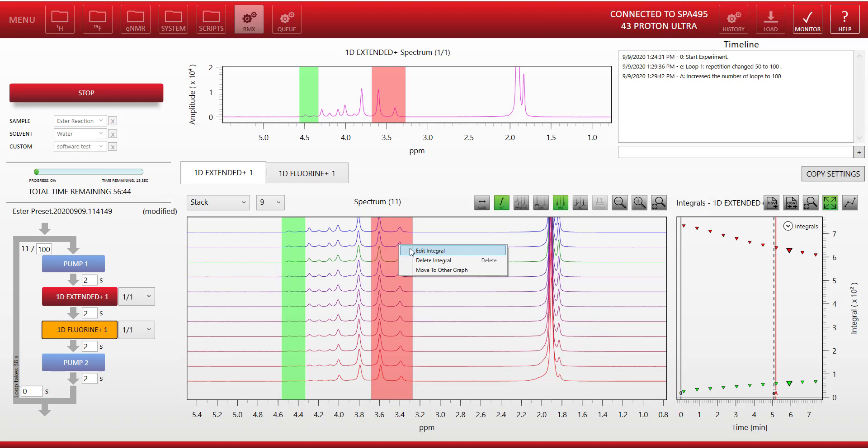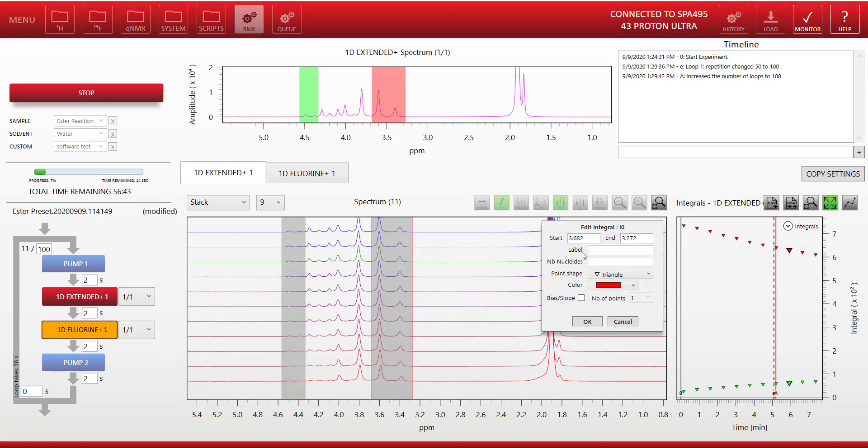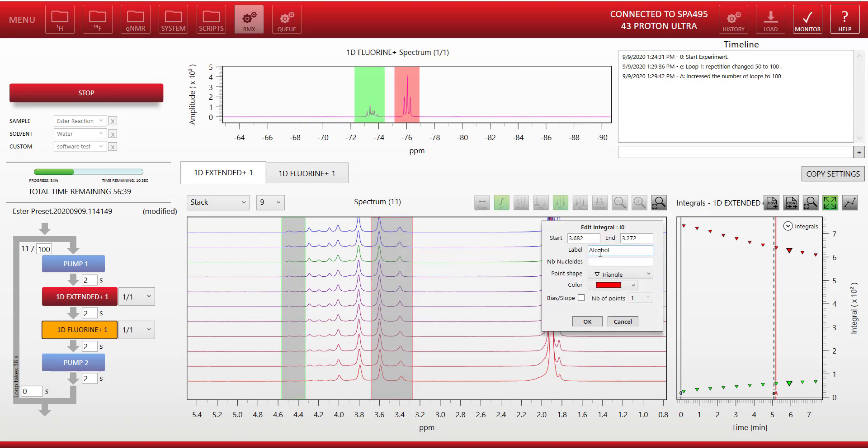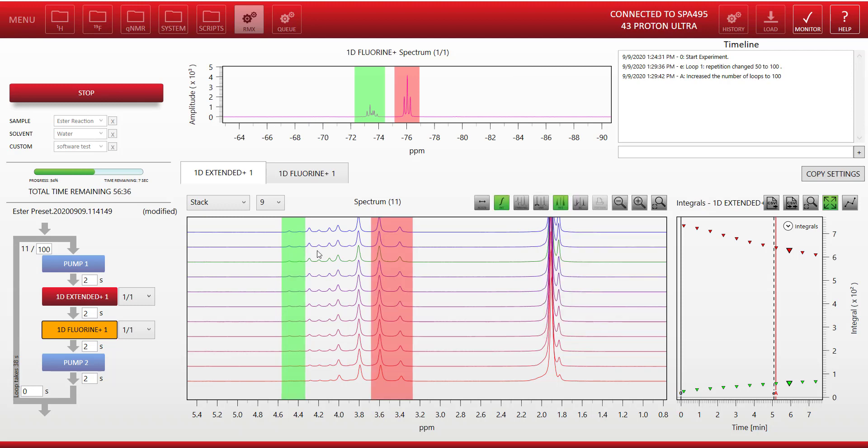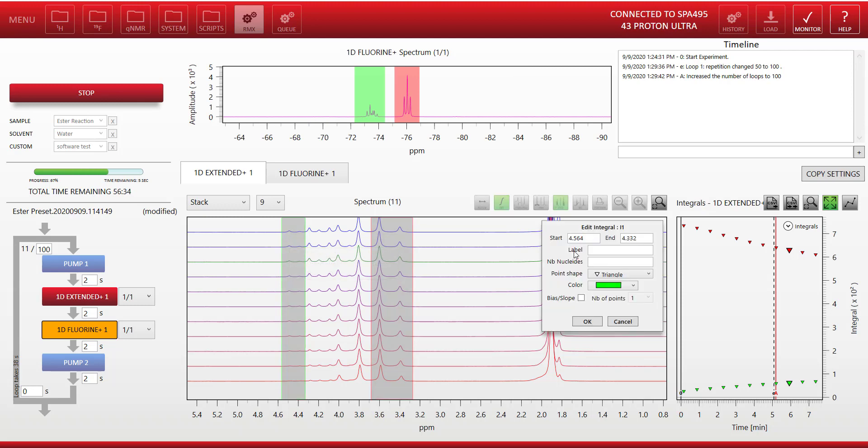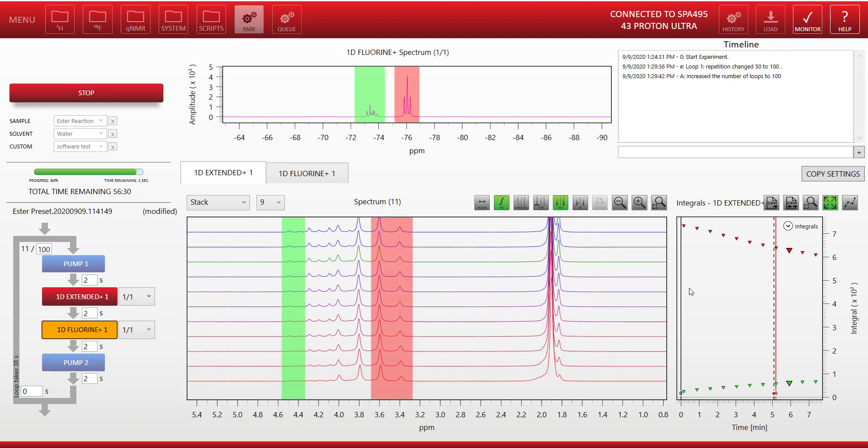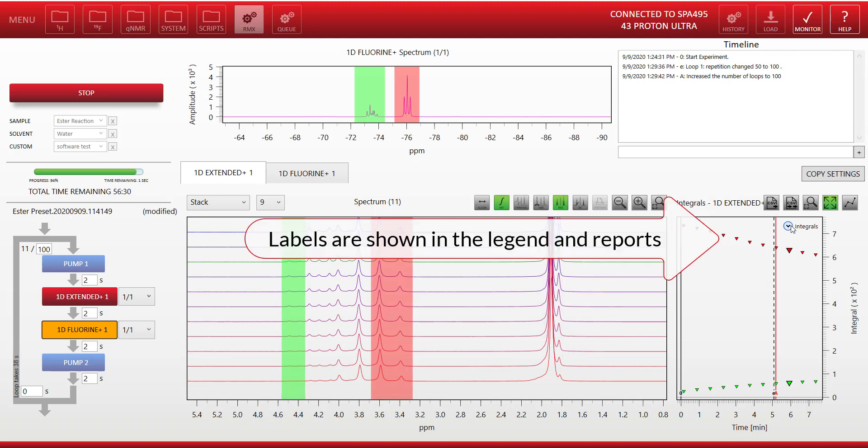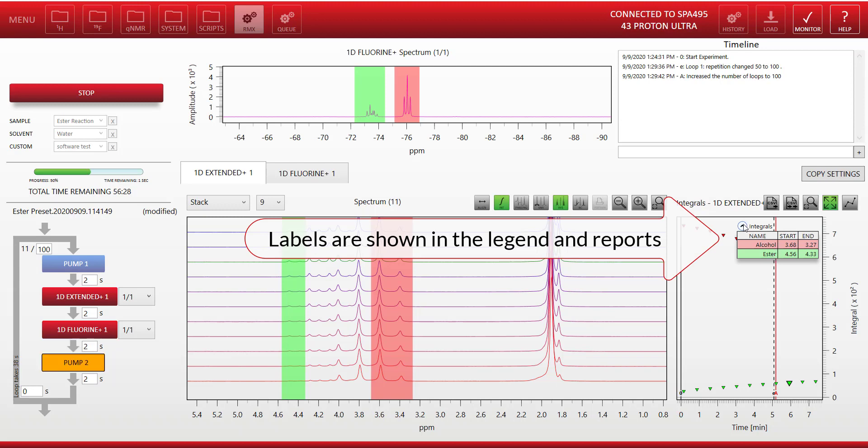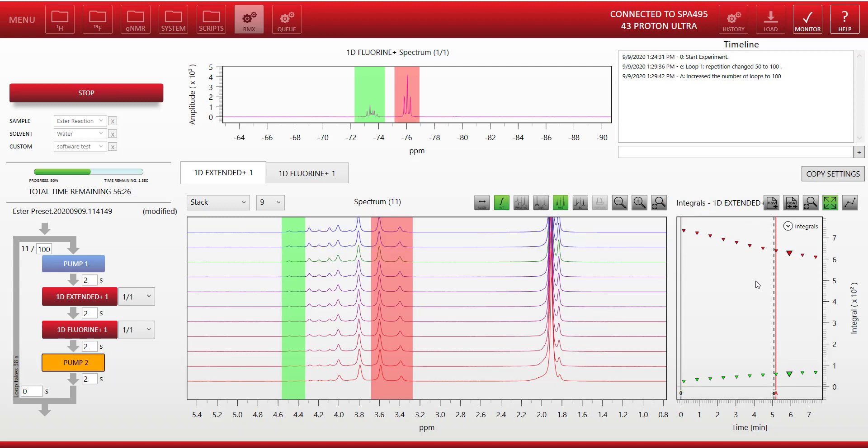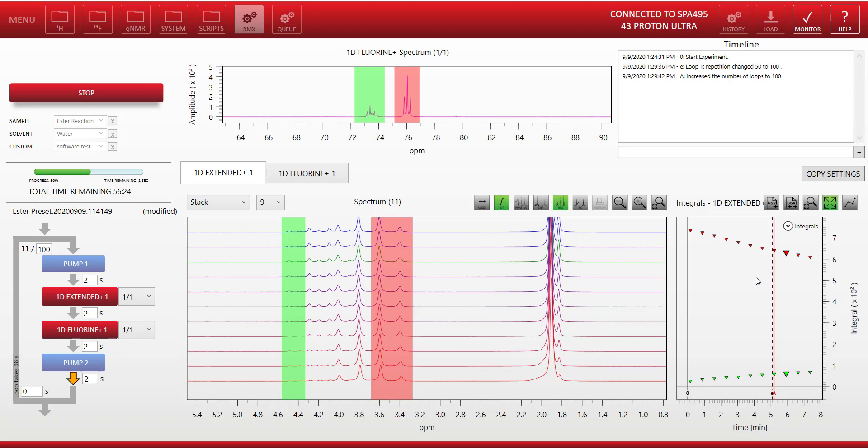Now as the reaction progresses we may want to edit the integrals. We can here attach a label to the integral. If we think for instance this integral is the alcohol in our reaction, and this is the ester product that's being formed, we can record those there. And now you'll see those notes are made in the legend of the integral plot.